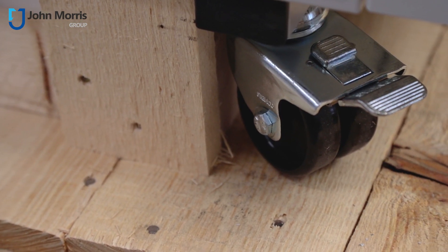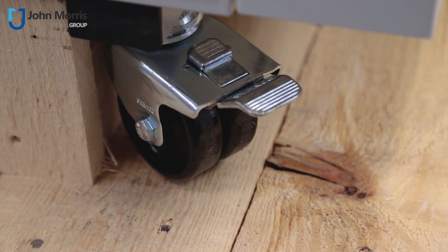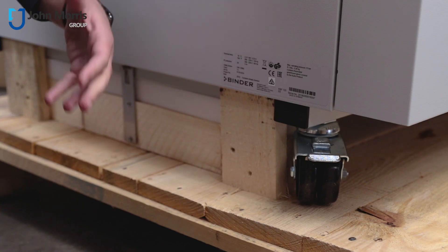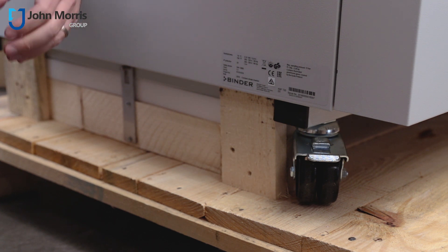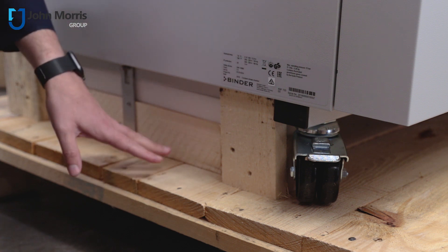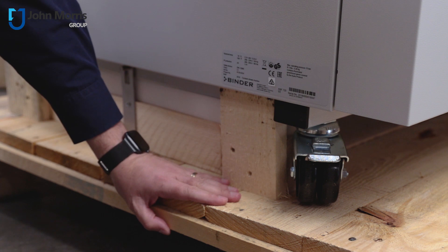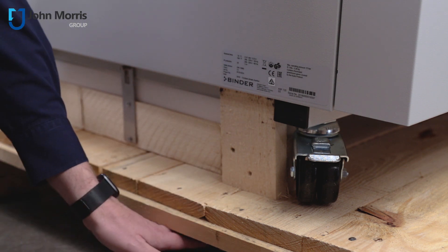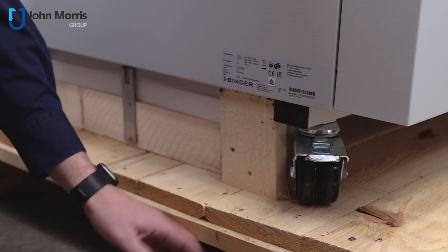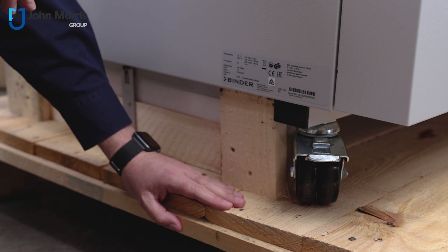The unit is supplied with four casters for easy positioning in your laboratory, then locking to make sure it doesn't move. Something you don't often think about when you buy a big climate chamber, or an ultra-low temperature freezer, or any other large chamber, is exactly how it's shipped to you. In this case, you can see that Binder have securely fastened it to a good quality wooden crate. That's really important, because when these things are shipped, forklifts go underneath to lift these devices up. Without a good quality crate, there's a high chance it will arrive in a damaged condition.